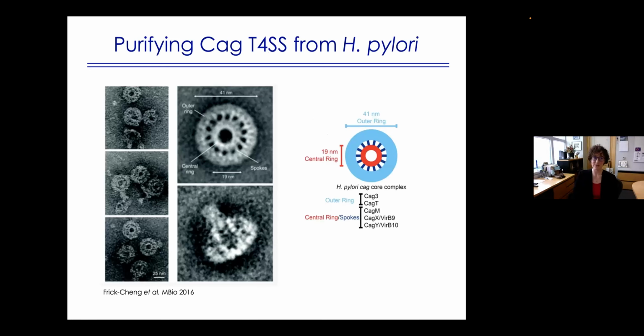And so she was able to get these complexes into negative stain. And we were able to get enough of these complexes to get some low resolution 2D averages. And if anybody has done negative stain, you might notice that I'm not showing really large fields of view of these complexes. That's because even in negative stain, it was very hard to find intact complexes. But we could see it was a very beautiful structure that had some symmetry, and here was a side view.